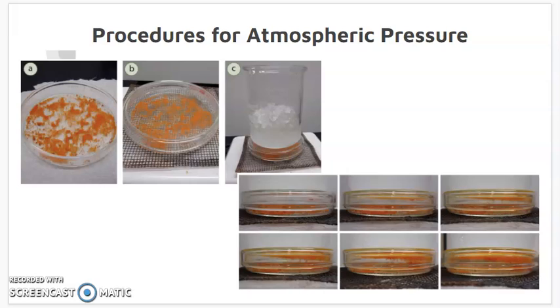Step 6. Remove the petri dish from the hot plate carefully. Use a heat-protectant glove to pick up the petri dish. Step 7. Separate the top and bottom of the petri dish and collect all the crystals that formed on the top. Then weigh out the pure crystals.